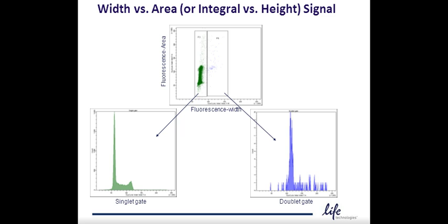The signal processing gating to eliminate aggregates is only recommended if the aggregates are clearly and completely separated from the singlet population. This is usually true for tissue culture cell lines and for hematopoietic cells. This method eliminates the doublets and the aggregates from the data analysis, and it depends on the instrumentation, particle shape, and the operator's selection of a gate.